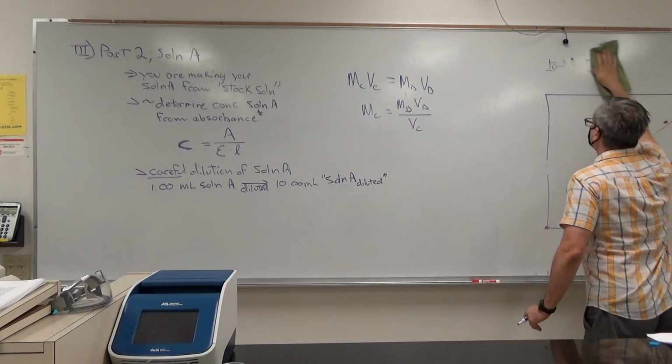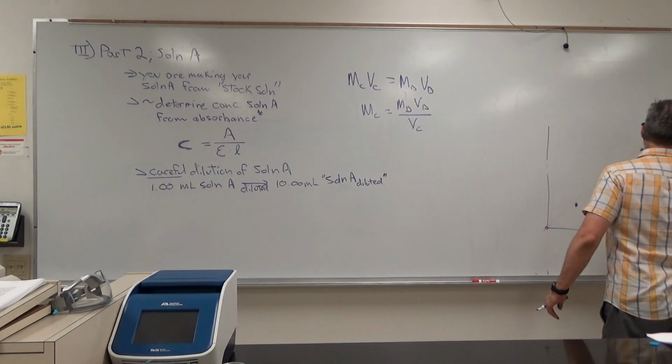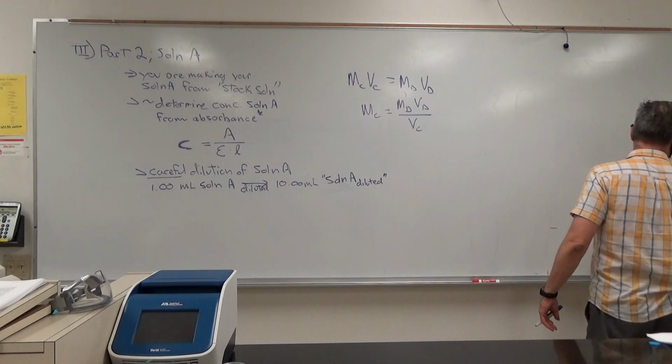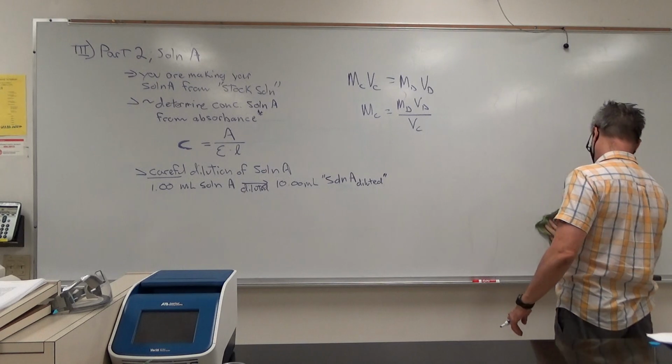Now, in part 3, we're going to take your solution A and we're going to do an extraction.